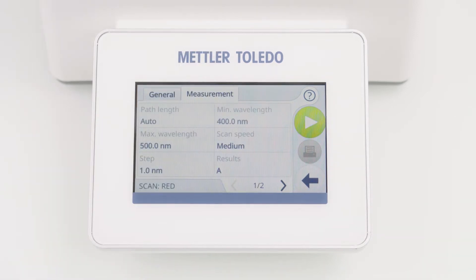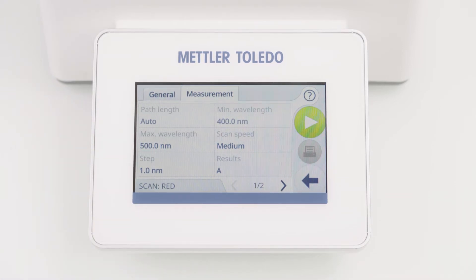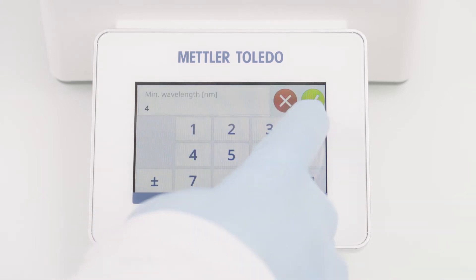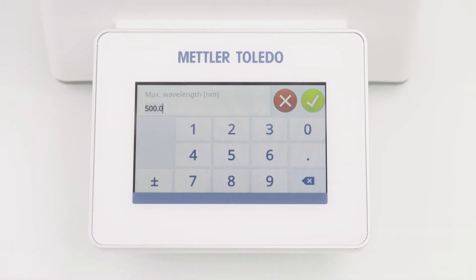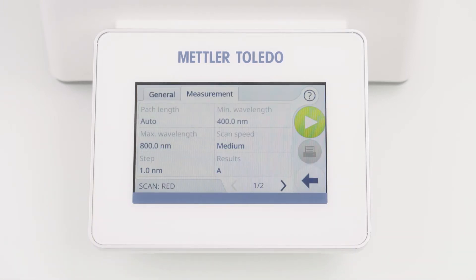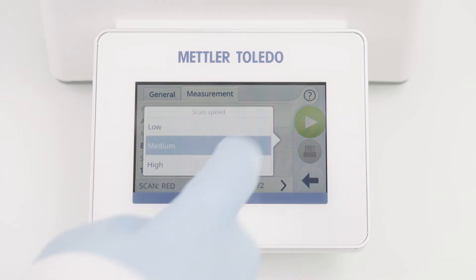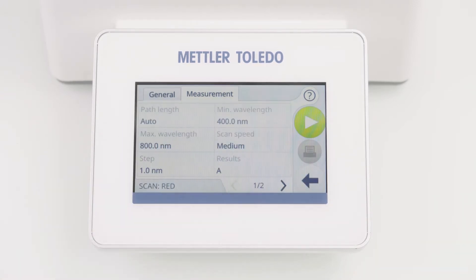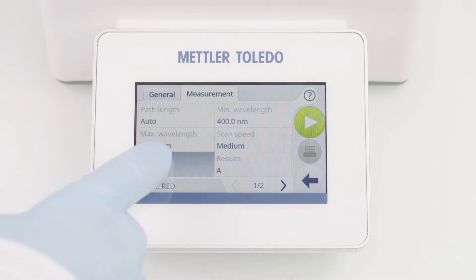The Measurements tab contains all measurement information. You can define the path length and the wavelength range, for example 400 nm to 800 nm. The scan speed can be set between low, medium, and high — I will go for medium. The step size options are 0.5, 1 nm, 2, or 5 nm — I will go for 5 nm.